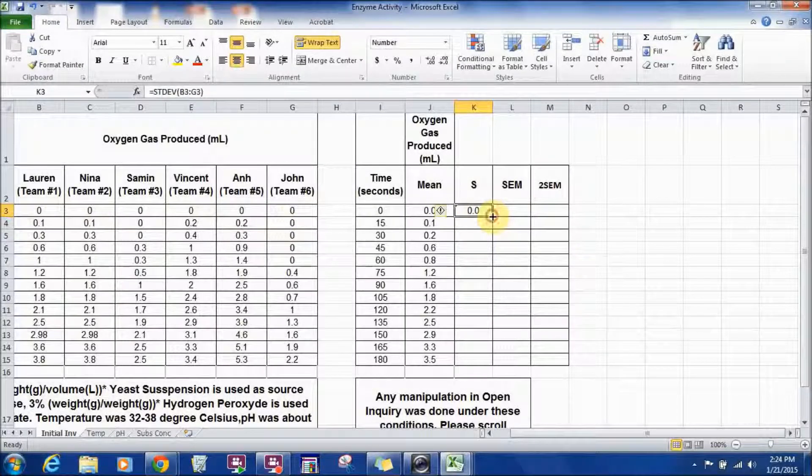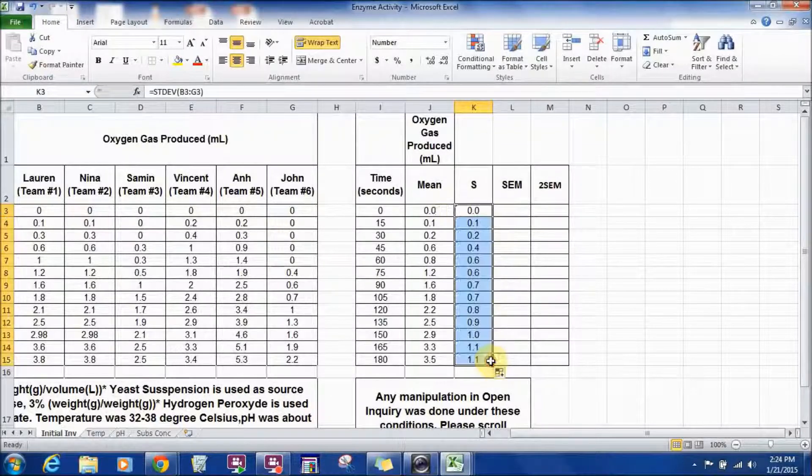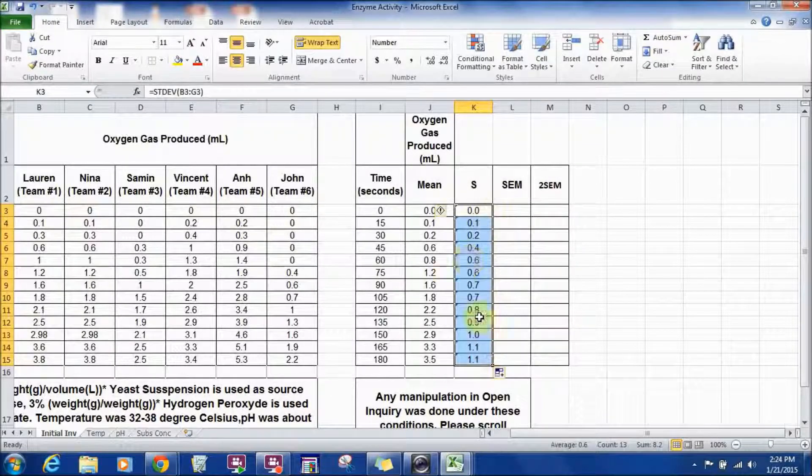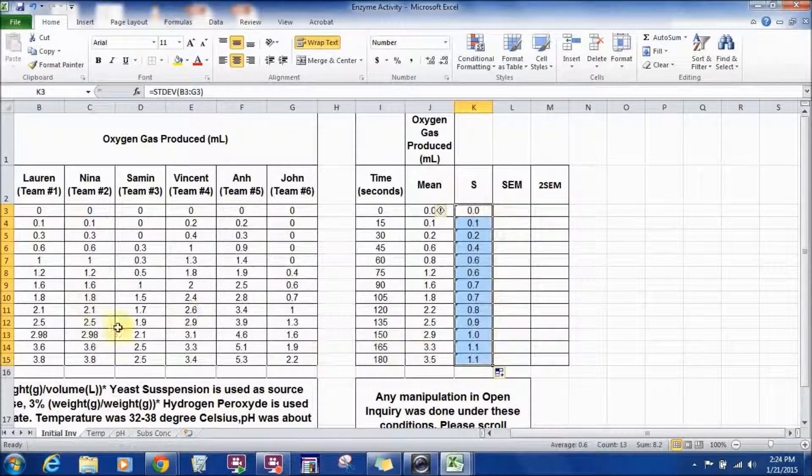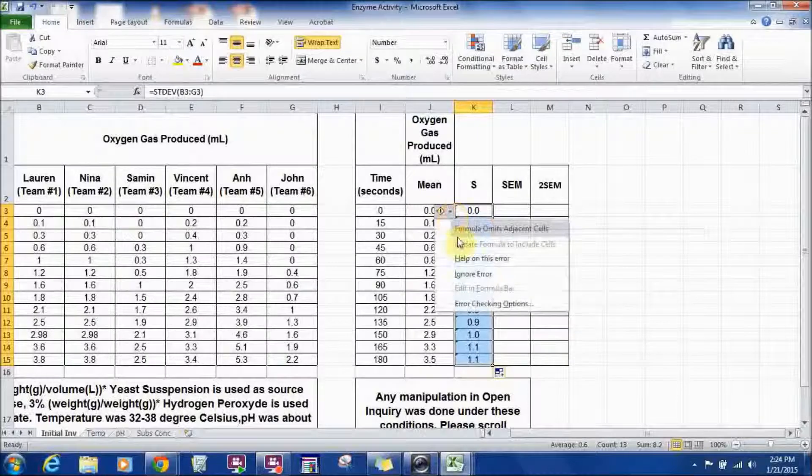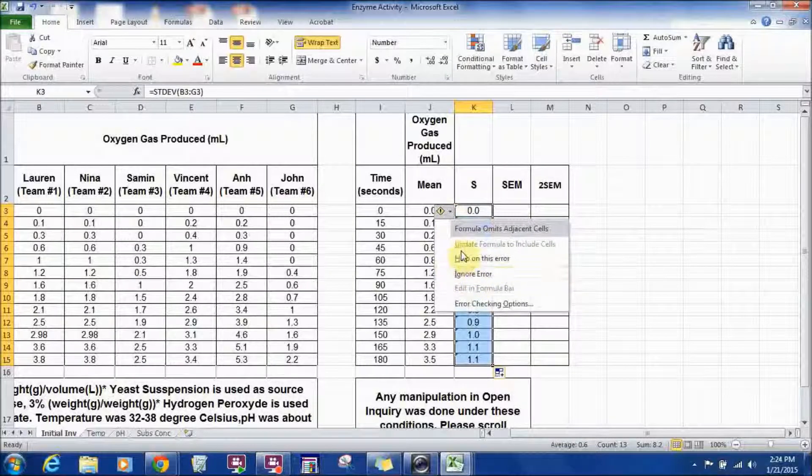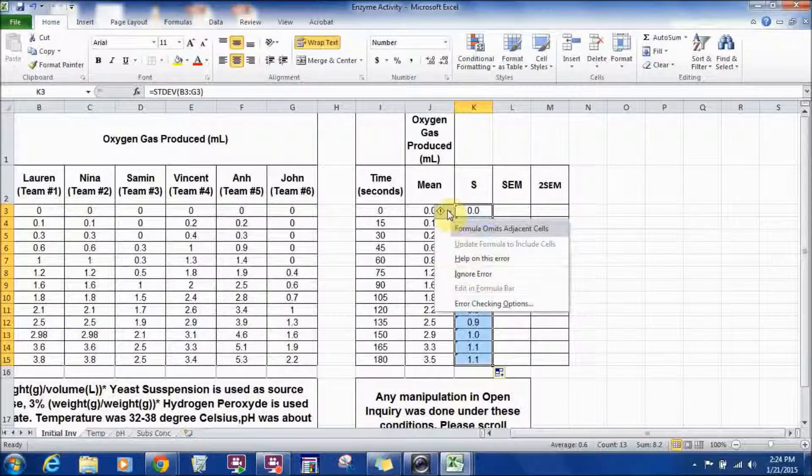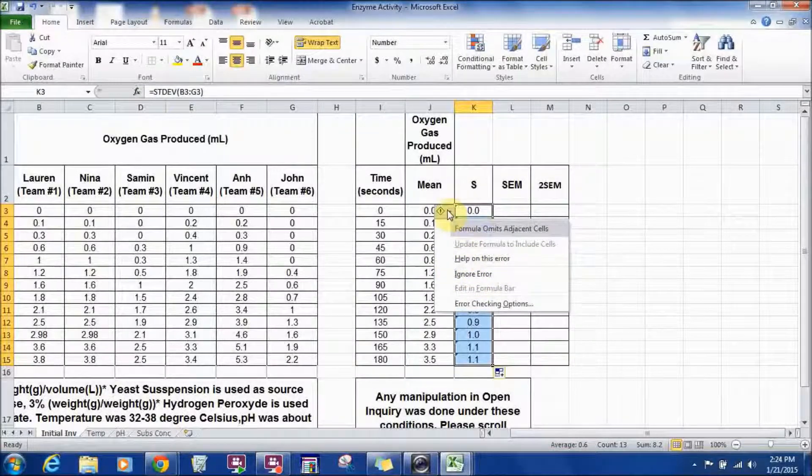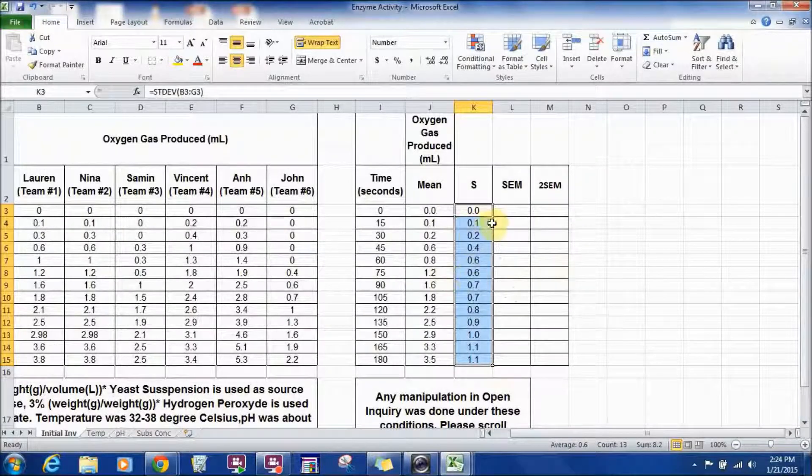And, apply the same thing, pull it down. And it will apply the same formula for each of the row. And again, just ignore the error. By clicking on that sign, it will give you a drop down menu. Select the ignore error.